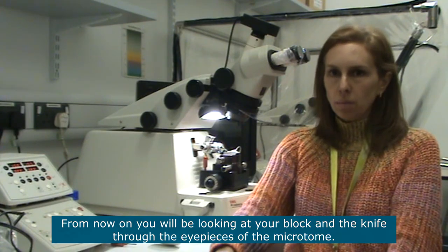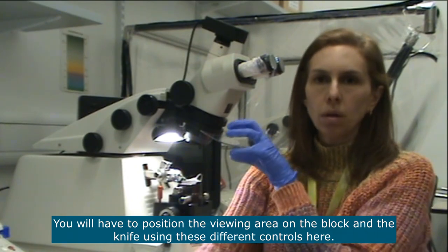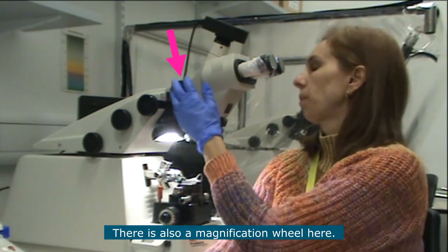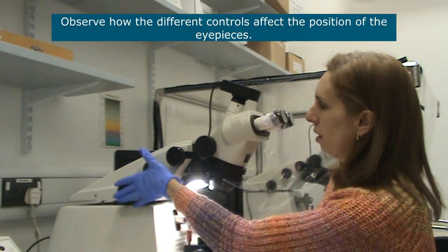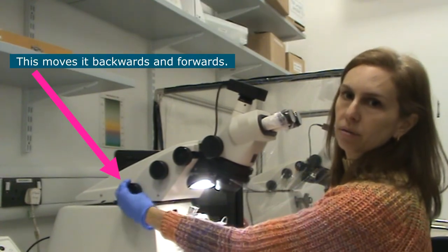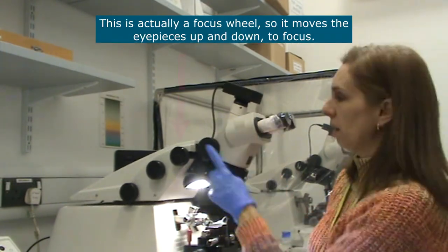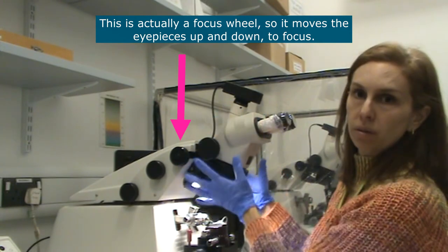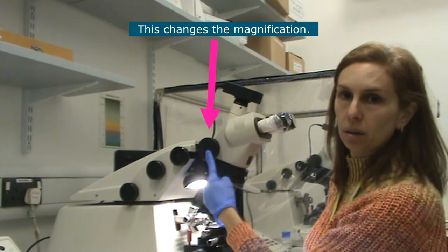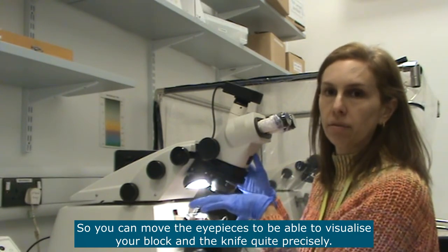From now on you will be looking at your block and the knife through the eyepieces of the microtome. You will have to position the viewing area on the block and the knife using different controls, and there is also a magnification wheel. This control moves backwards and forwards; this one tilts forwards; the eyepieces can also be moved sideways; this here is the focus wheel which moves the whole structure up and down; and this changes the magnification.